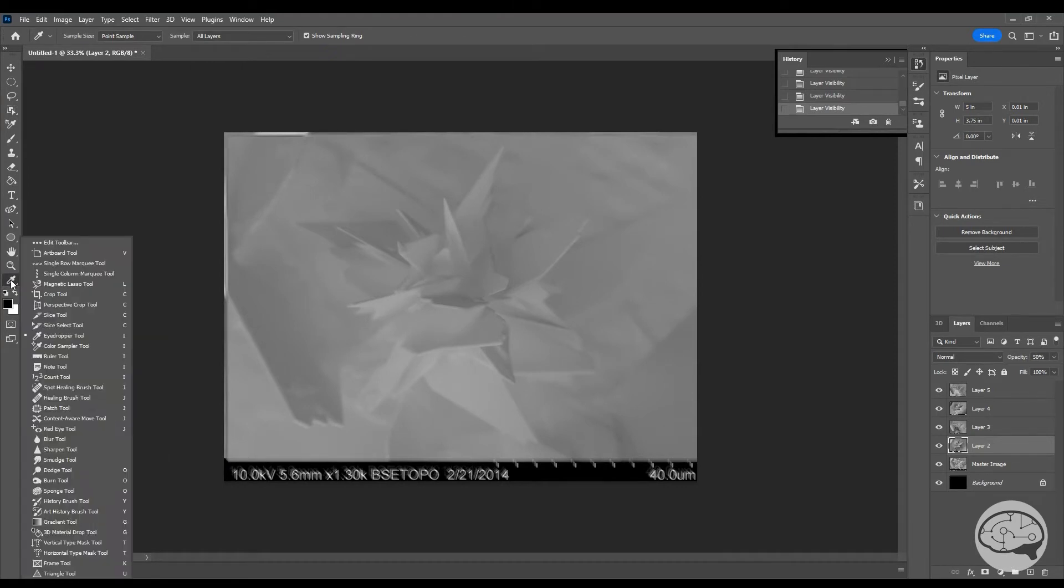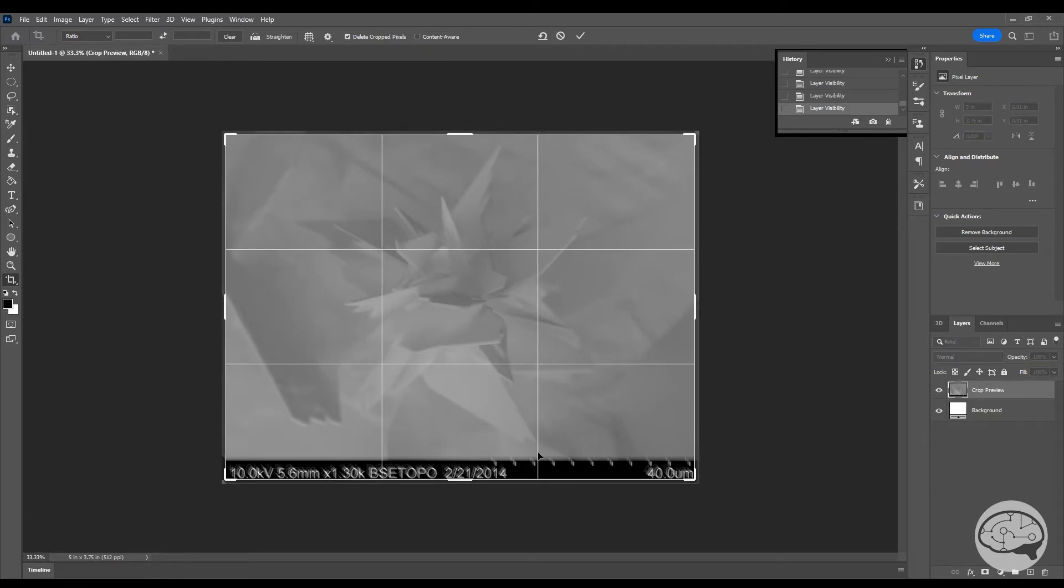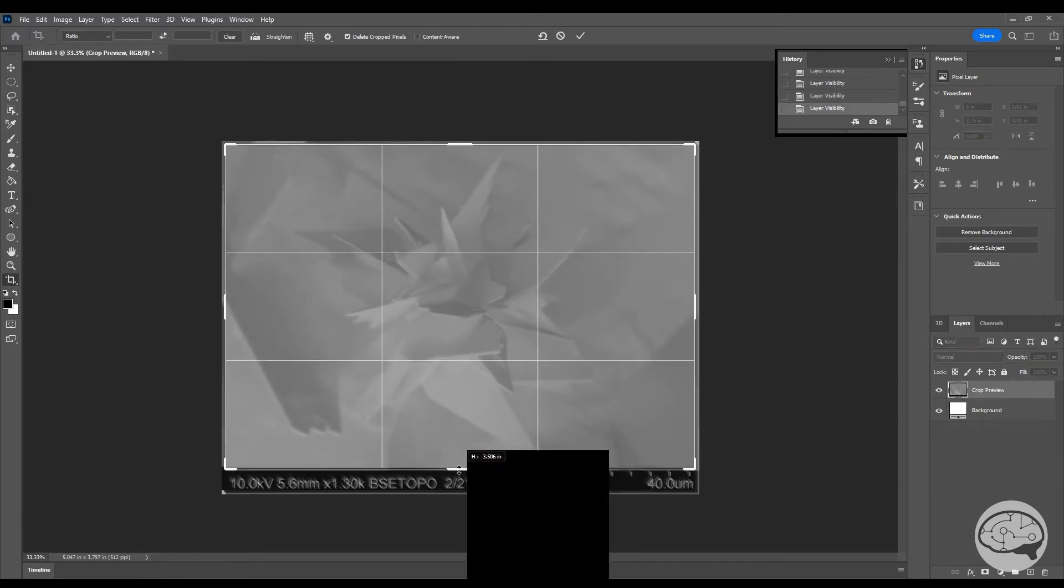After we aligned our images, some of the edges might be a little messy, or maybe we have a data bar from the SEM still in the image. In either case, we'll need to crop that out.